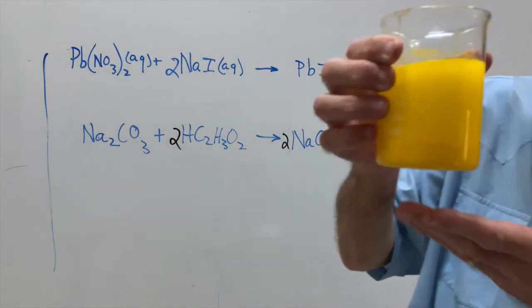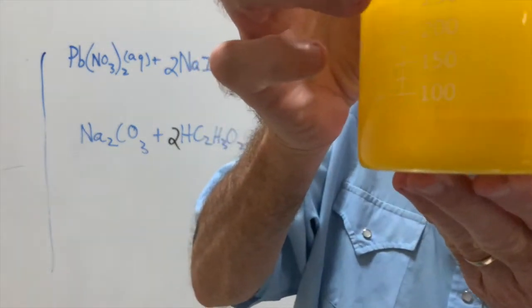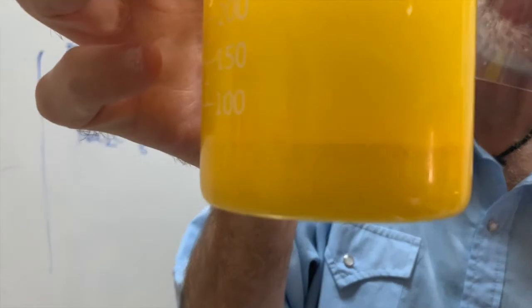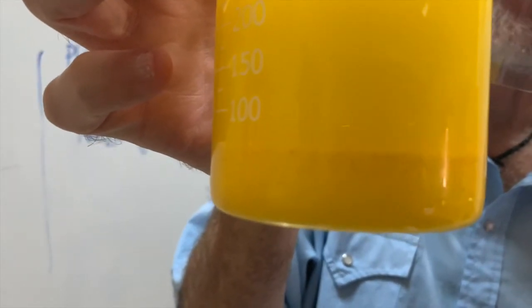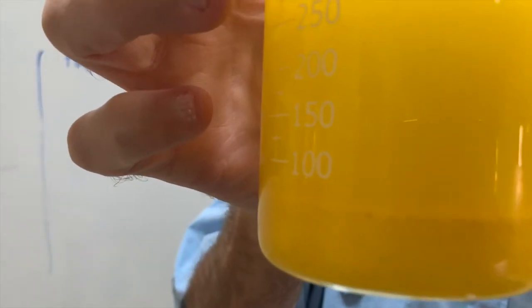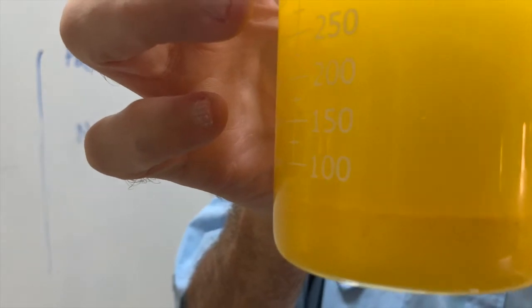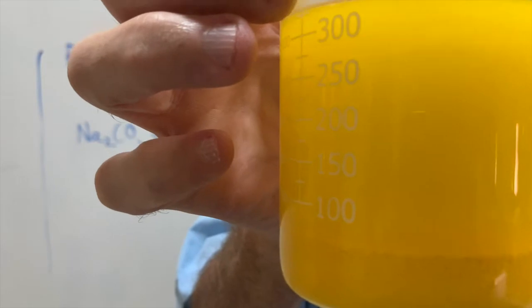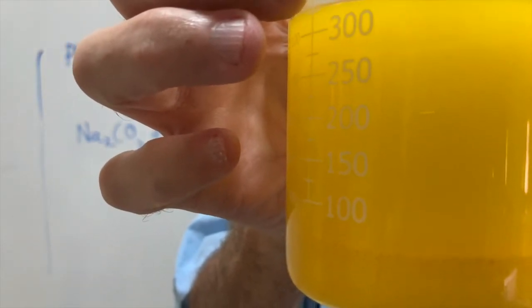You can definitely see the precipitate at the bottom forming. Do you see that? Is that clear on your side of the camera? What happens if you pour it out? Does it come out liquid or does it stay? No, it would kind of be a slush. It would mainly stay there, but then you'd have a slurry.